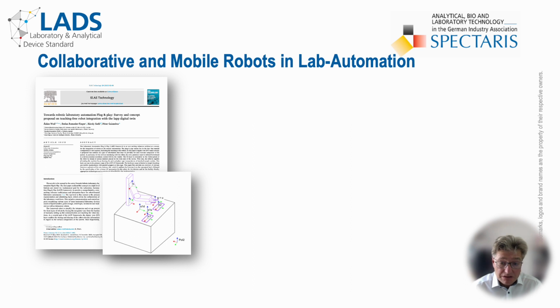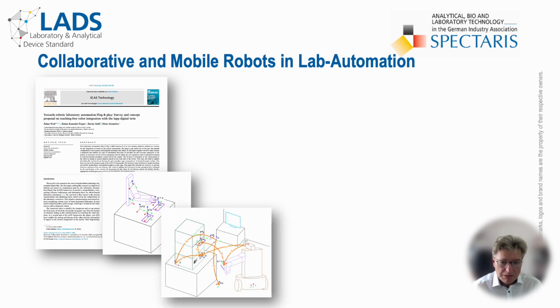Some illustrative images from one of his publications: a cobot on a laboratory bench transferring plates, a mobile robot performing pick, transport and place throughout the laboratory. To achieve teaching-free robot integration, the lab concept requires defining geometric positions for labware handover and other robotic actions for each instrument. In a best-case scenario, this information is directly provided by the instrument or its digital twin.